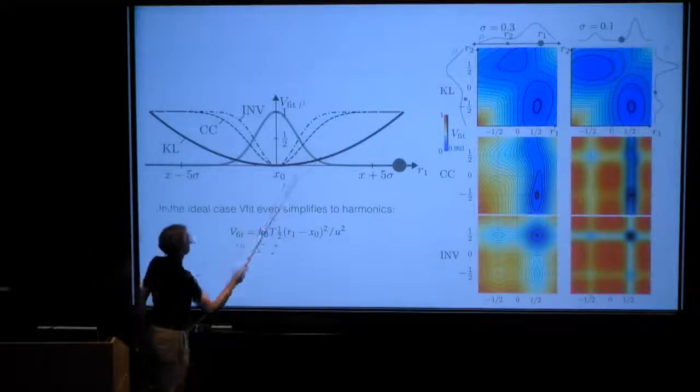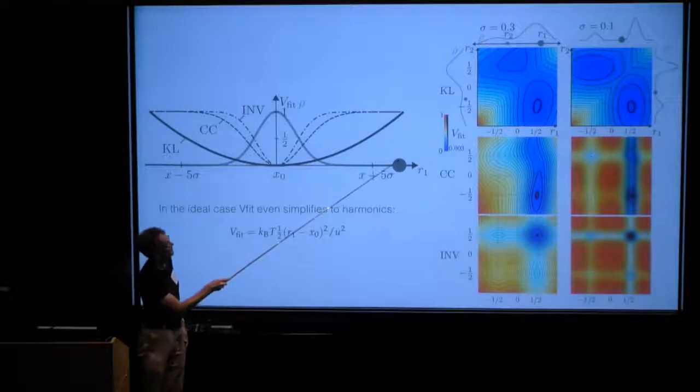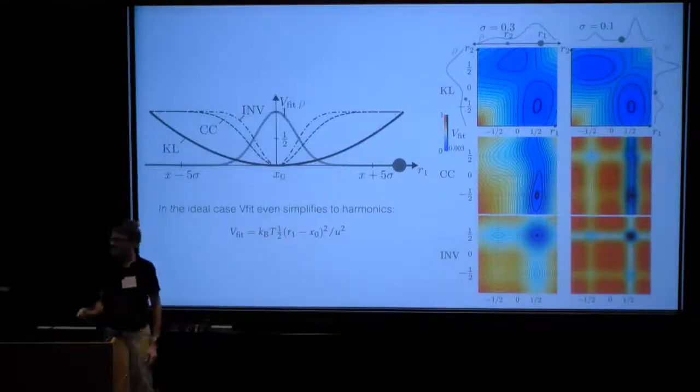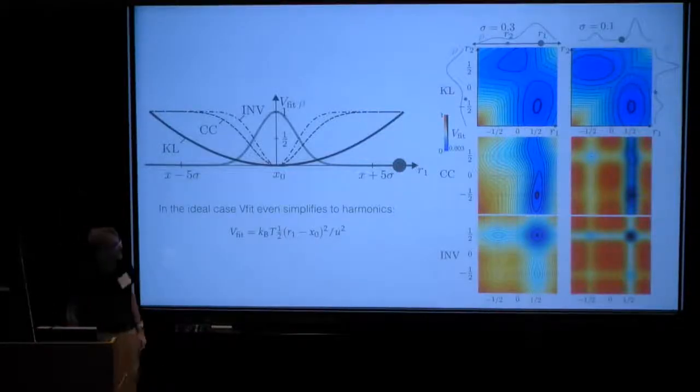Now, that works great in the sense that you put the electrons there, but if I have a particle out here, the problem is this particle is not going to feel any derivative here, right? So you get beautiful convergence if you're very close to it, but otherwise you're not going to feel anything. And the cross correlation is afflicted with roughly the same problem.